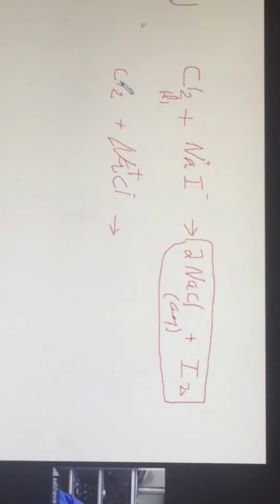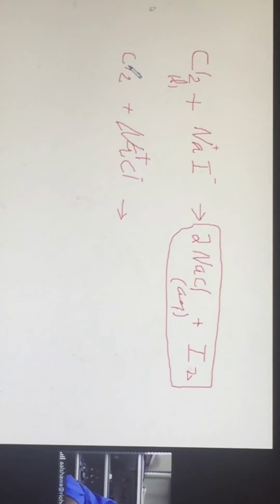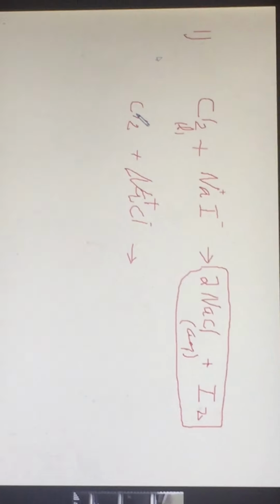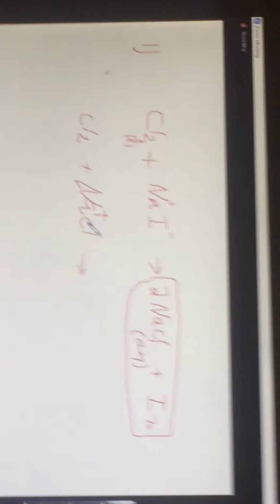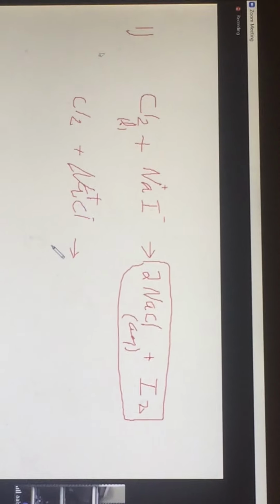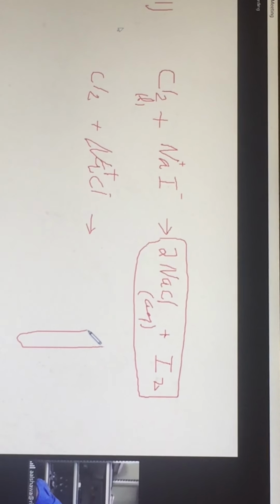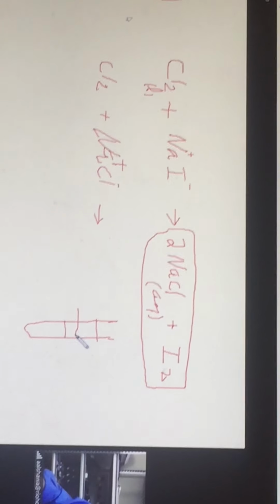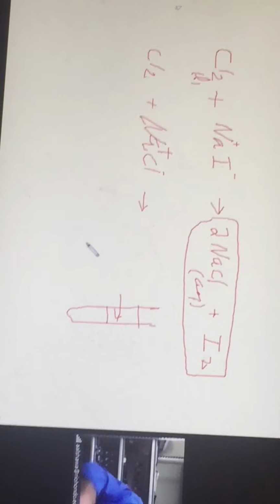You can tell by the color of the chlorine in that bottle. If there's a small amount remaining, you can detect that hint of yellow, or sometimes you can't, which means most of it evaporated. But that solution, added to the clear sodium chloride solution, gives once again a clear solution in the hexane layer.